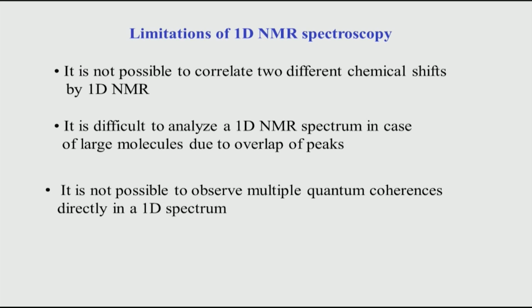So, that was simple, but now if I go to some other molecule, we will see some examples down the line. If I go to some other molecules where there are more than these pairs of protons, so CH2, CH3, I call them a pair. If I see such multiple pairs in a proton spectrum, I do not know which pairs are correlated with each other. So, which CH2 and which CH3 are correlated with each other. That information is not obtainable from a 1D spectrum. So, one has to therefore use 2D NMR, which will help us to know which pairs are possible.